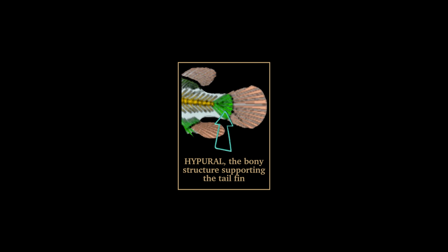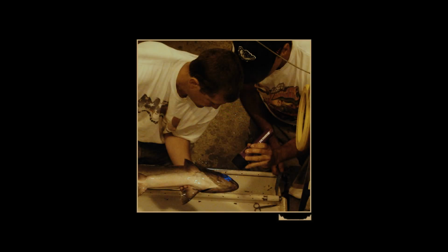When you do the hypural, the eyeball's not going to move and they're not going to grow more vertebrae, so that's actually a true measurement of that fish in its adult stage. And then from there we take scales off the fish, and they'll have rings on them like a tree. Farther apart is the spring-summer growth, closer together is the fall-winter growth. So you can age your fish, and they'll also have a saltwater check so we know when they went to the saltwater. And then we weigh the fish in kilograms.